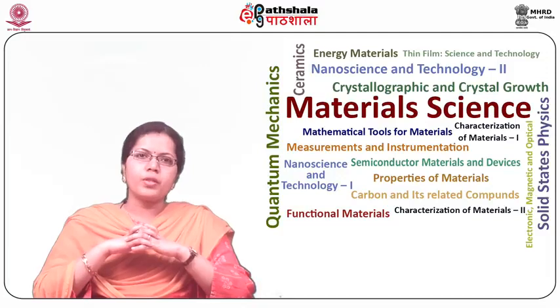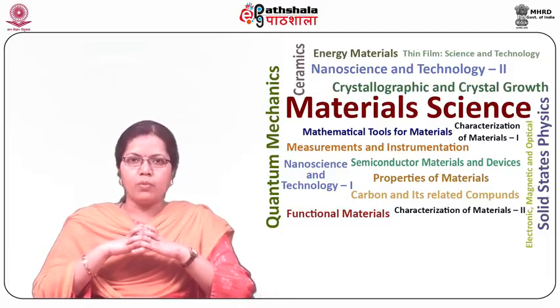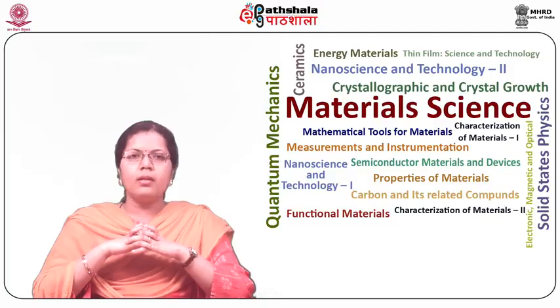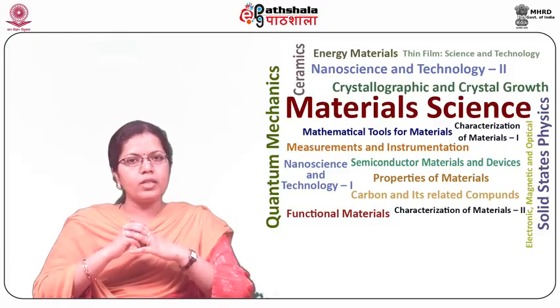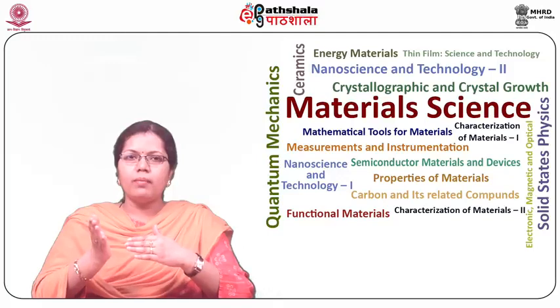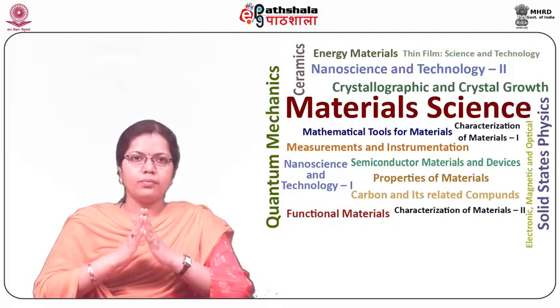Optical microscopes are also called light microscopes and employ visible light and magnifying lenses to see tiny things. The optical microscope has been one of the most important tools in many scientific fields as well as industry. For example, biotechnology, the pharmaceutical industry, cell or microbiology, nanoscience, and microelectronics, etc.